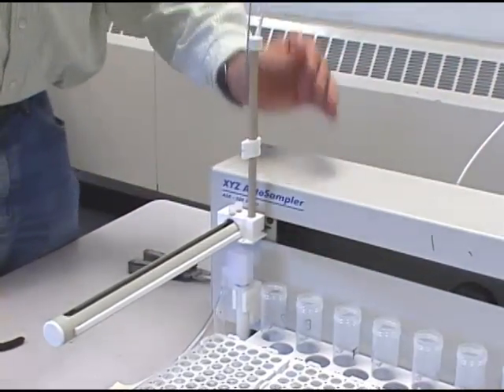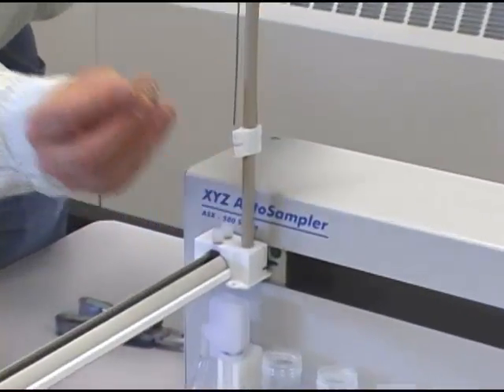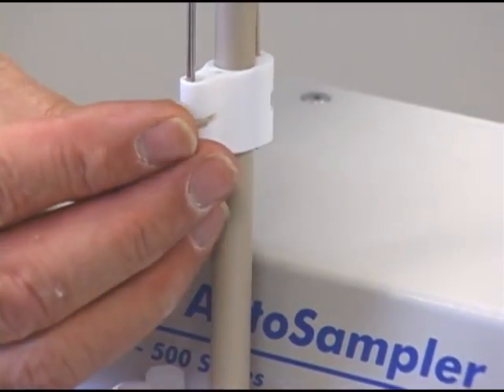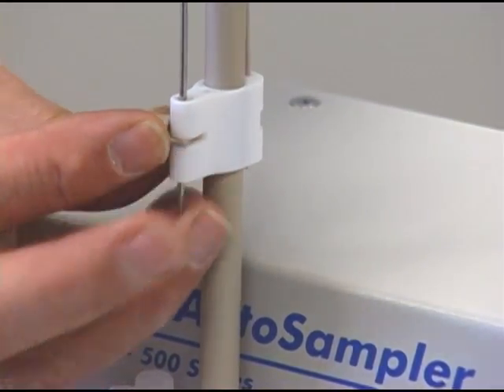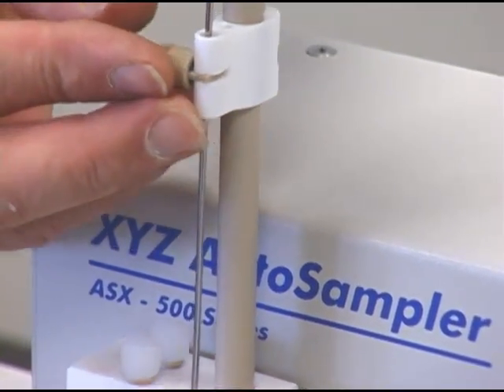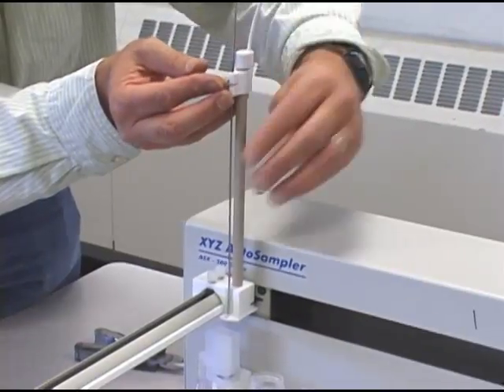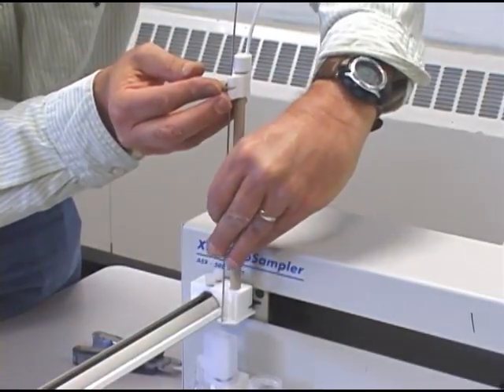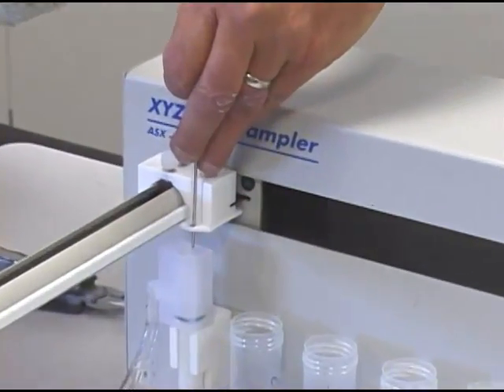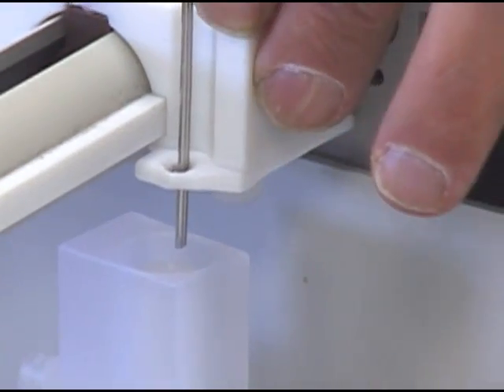Screw them back in with your nylon screws. We'll take the sample probe and feed it through the slider — make sure you also feed it through the locking nut. We'll take this slider all the way to the top and feed the probe just a couple of millimeters through the end of the hole there on the sliding block.